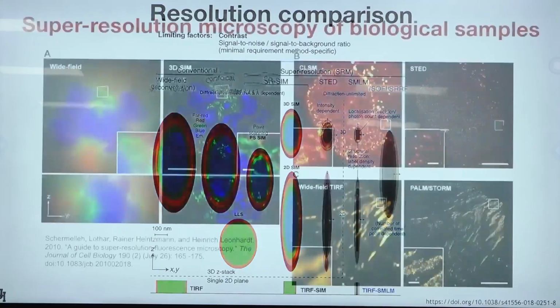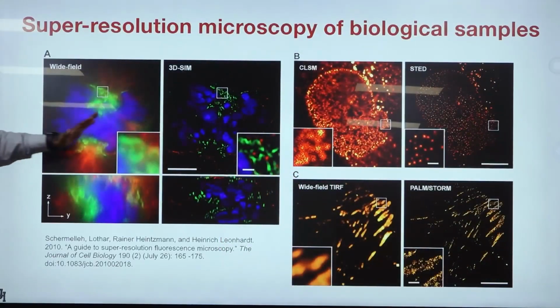Here are many different applications of wide field, structured illumination, STED, PALM, STORM, and so on. People in medicine and biology use these quite often for building all different kinds of imaging systems.